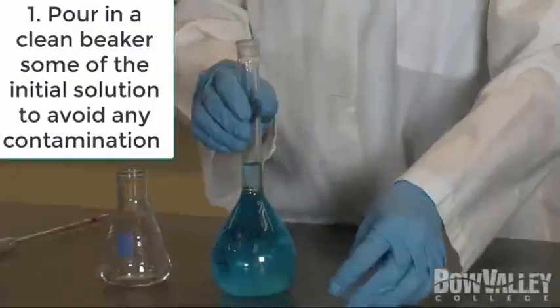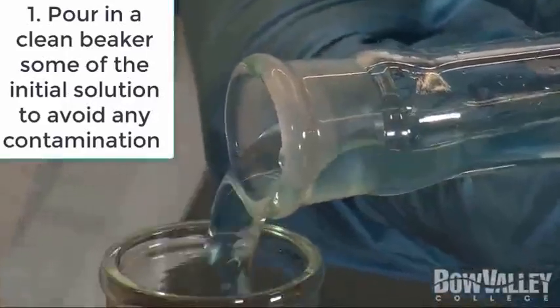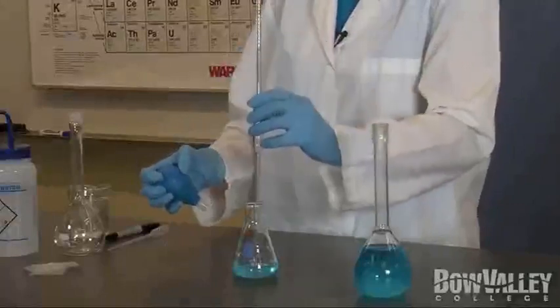Here's our stock solution. We do not want to contaminate it by directly inserting our pipette, so a small amount is first transferred to an Erlenmeyer flask. To use the pipette, place the end in the liquid to be collected.